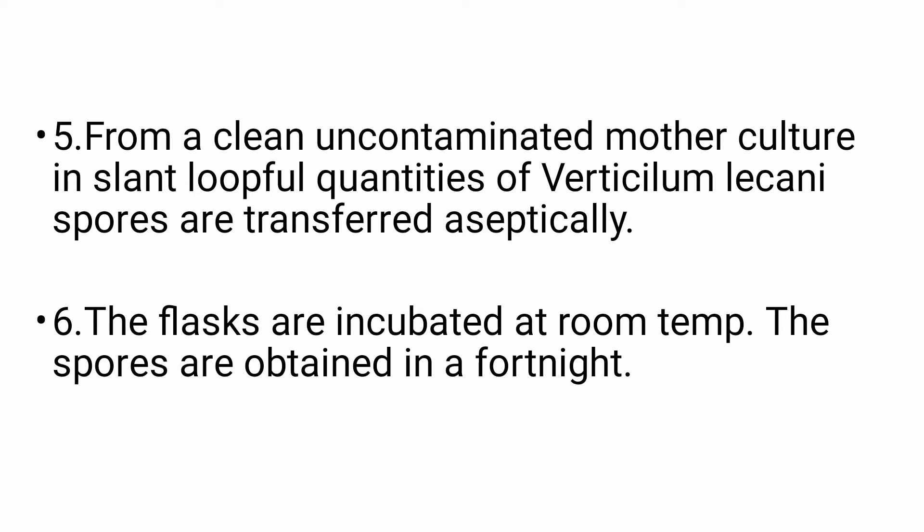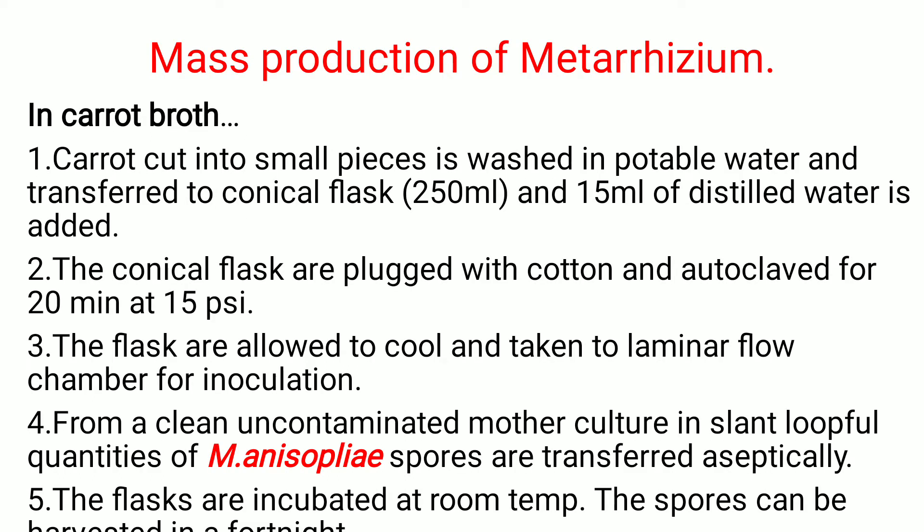The next is mass production of the second entomopathogenic fungus, Metarhizium, on carrot broth. Cut the carrot into small pieces, wash in potable water, and transfer into a 250 ml conical flask. Add 15 ml of distilled water, plug the flask with cotton, and autoclave for 20 minutes at 15 psi to sterilize the carrot pieces. Allow the flask to cool after 20 minutes.